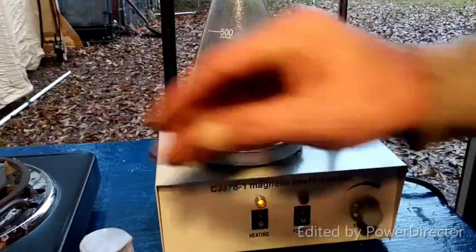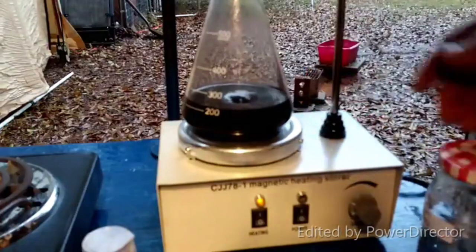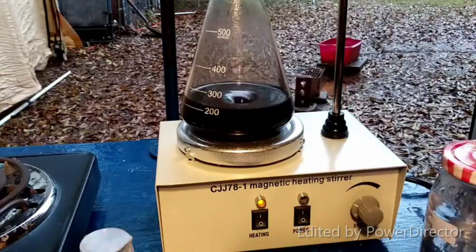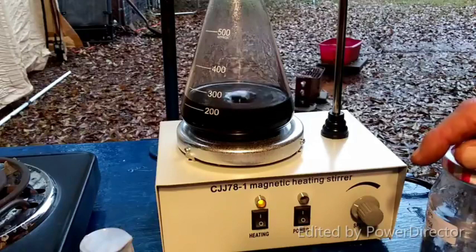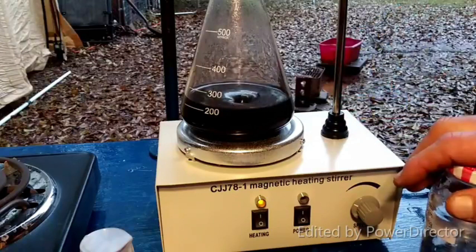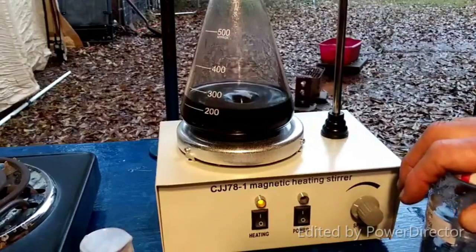I mean, it matches up with the description of platinum disulfide. It's not metallic platinum. There is a difference, and I don't know if the camera will pick it up, but you can tell it's not black. It is a very dark brownish color. So maybe it's impure, maybe it's not platinum disulfide, although again, I don't really see what else it could be. If you've got any thoughts as to what that is, leave them in the comments, but I'm officially counting this one since the whole point of this video is to see different platinum compounds, and although I wasn't going for anything this dull looking, platinum disulfide is definitely a platinum compound I have never seen. So, making lemonade out of lemons.